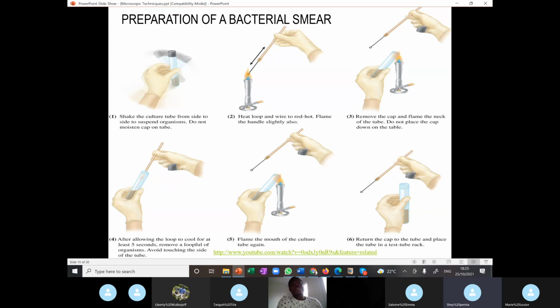And then second, the fact that bacterial components stain differently, I can also use staining to start differential classification. We spoke last class about gram staining. We also spoke about acid-fast staining, capsular staining, spore staining, and so on. So these different types of staining help us to begin the initial categorization or classification of organisms.